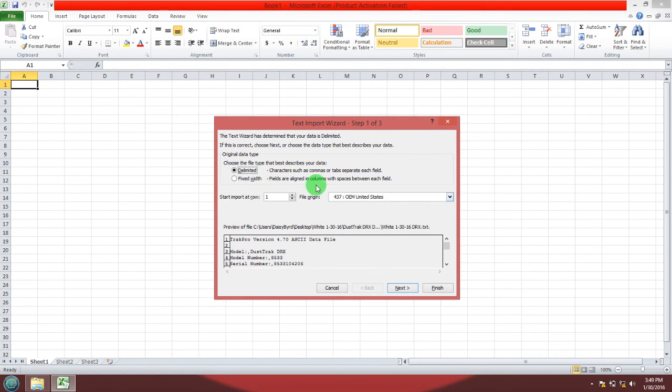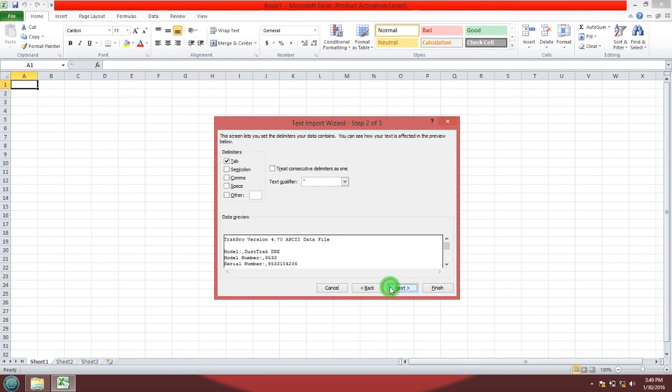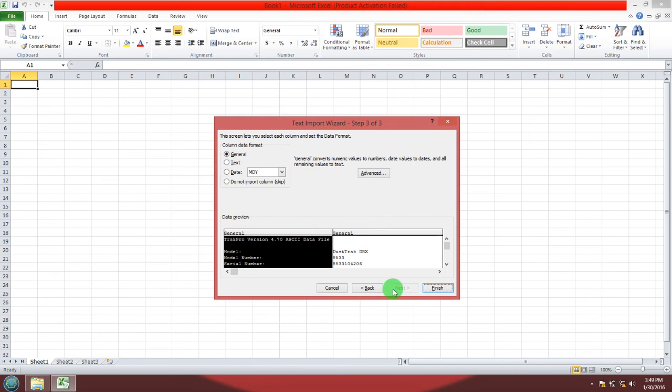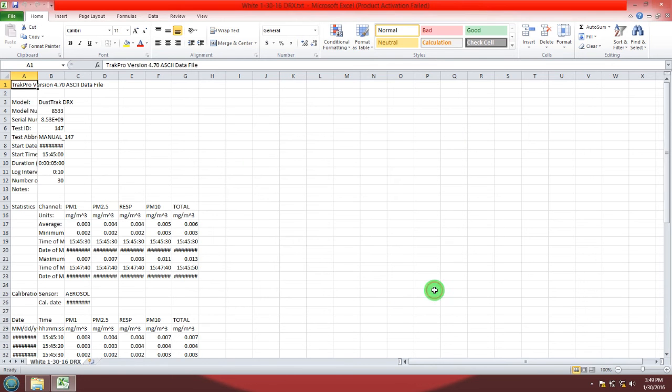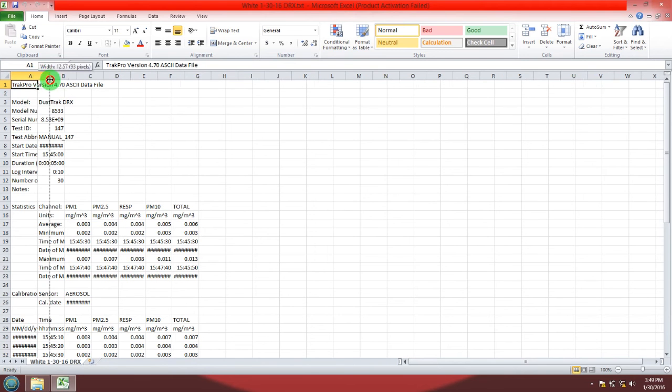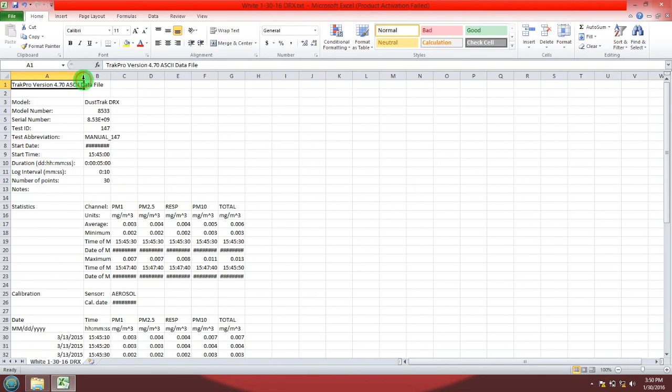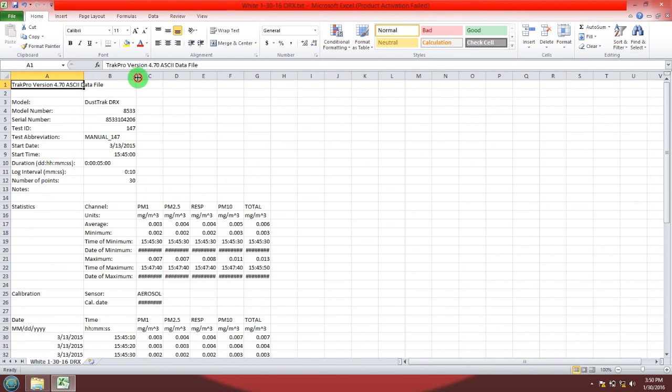Select delimited. And just like in the TRACK PRO software you're going to select comma. Now all your data has been imported into Excel and you can stretch out the columns so that you can see all the information.